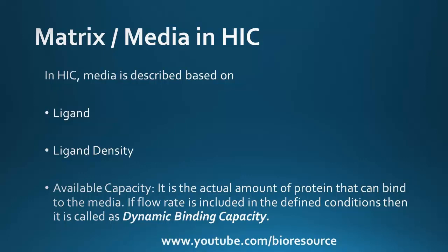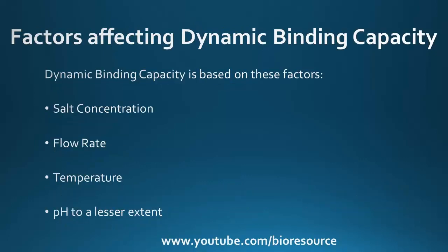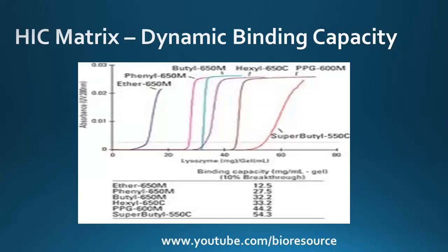If flow rate is included in the defined condition, then it is called the dynamic binding capacity. The dynamic binding capacity depends on factors like salt concentration, flow rate, temperature and pH. Here are some examples of dynamic binding capacity of different HIC matrices.